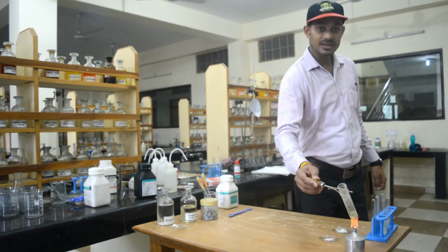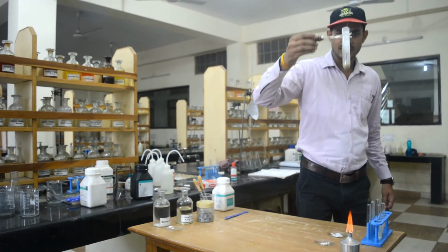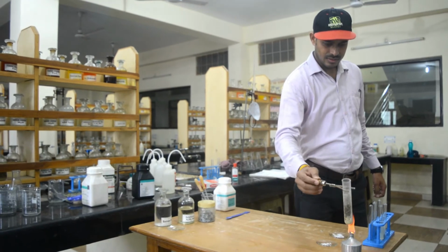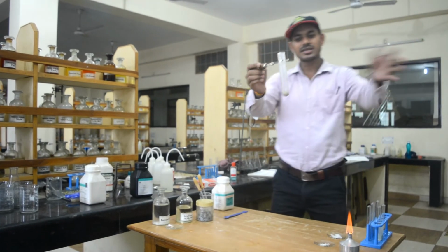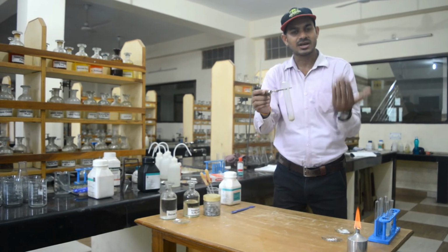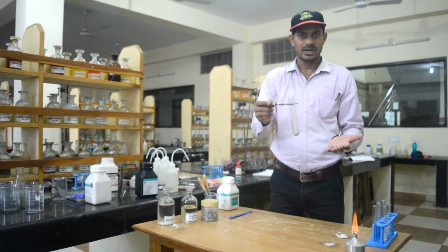Now you can see that there is some change in the color of this ferrous sulfate. The green color has changed. It shows that the chemical has changed into another form. Here, ferrous sulfate has been converted into ferric oxide because it is heated in the presence of oxygen.